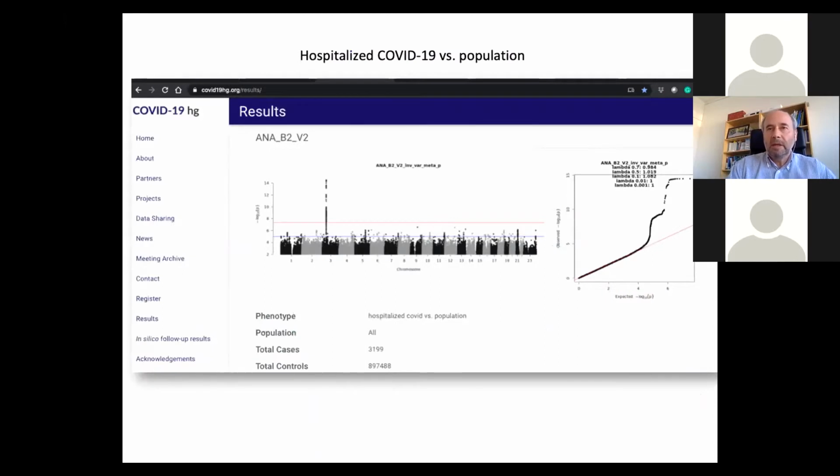So today I will look at data from this COVID-19 website, where several comparisons were done. A lot of patients were genotyped using microarrays, and a comparison was already done in this tool.